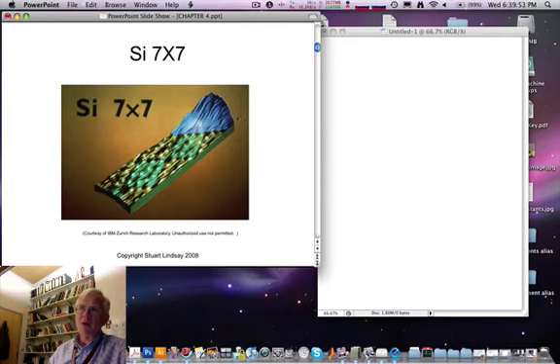You can see the microscope only worked for a small area of the sample, and interestingly enough, even IBM did not have a computer to control their microscope. So this image was made by cutting out fragments of duplicated chart recorder scans of the surface and then gluing them together to make a 3D model, if you can believe that. Nonetheless, this 3D model caused a sensation and led to the award of the Nobel Prize in Physics to Heini Rohrer and Gerd Binnig, shared with Ernst Ruska, who invented the electron microscope.